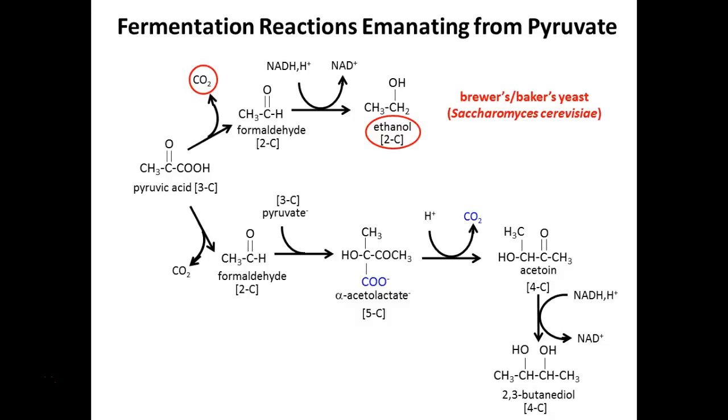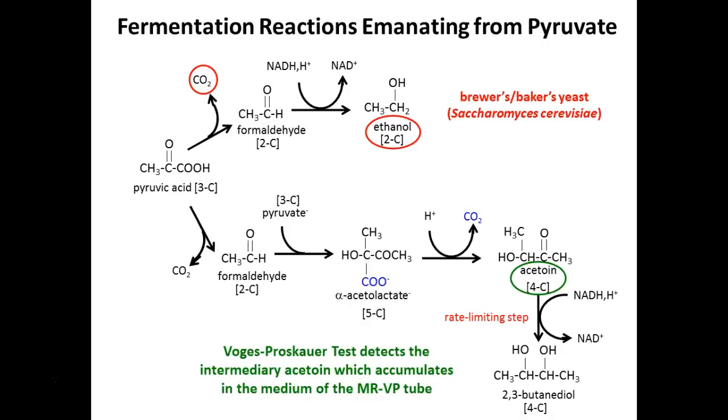This is different, ladies, from acetone. They used to take, or guys, fingernail polish remover, acetone. Different molecules. This is acetoin. So the VP test, the Voges-Proskauer test.